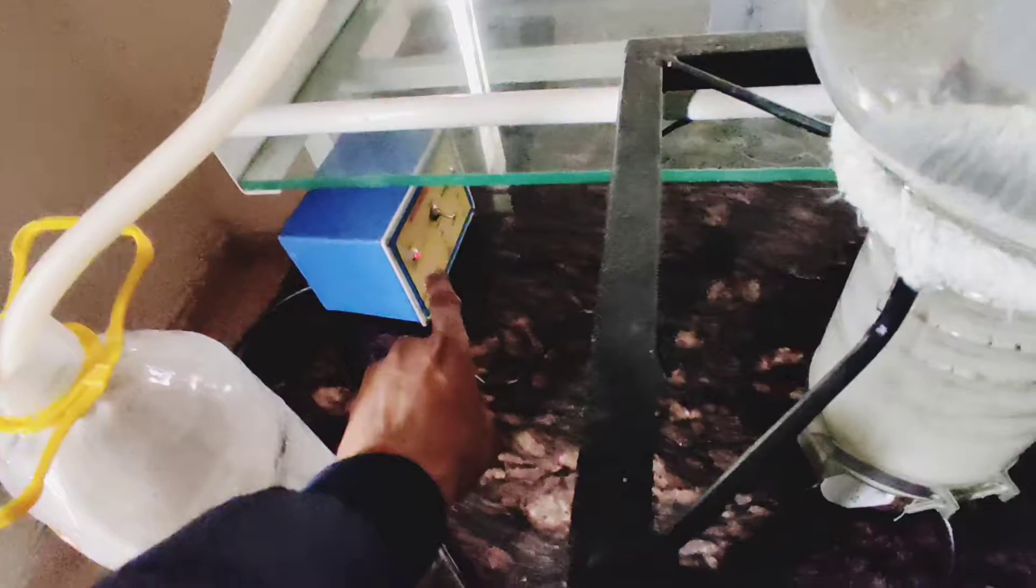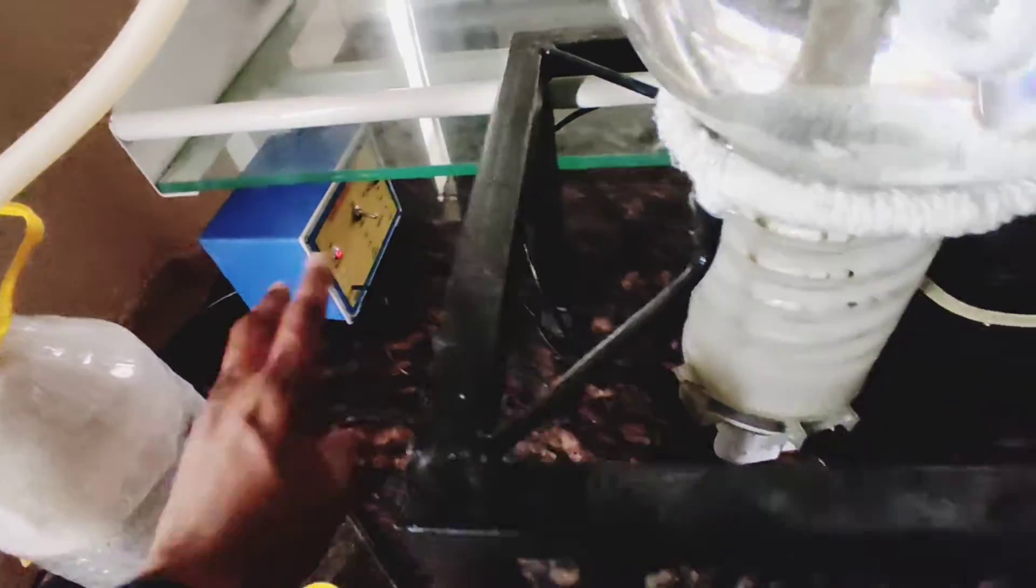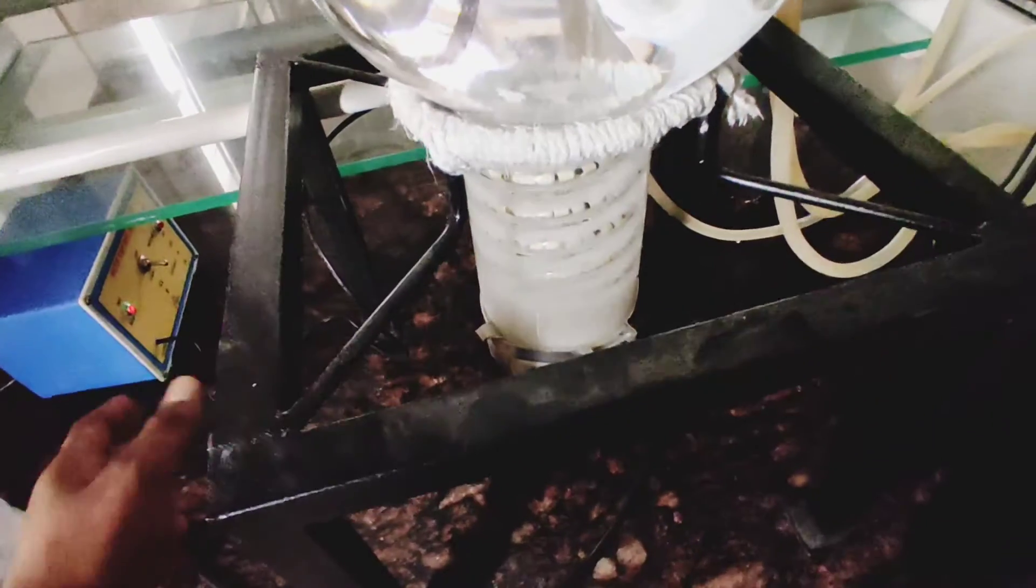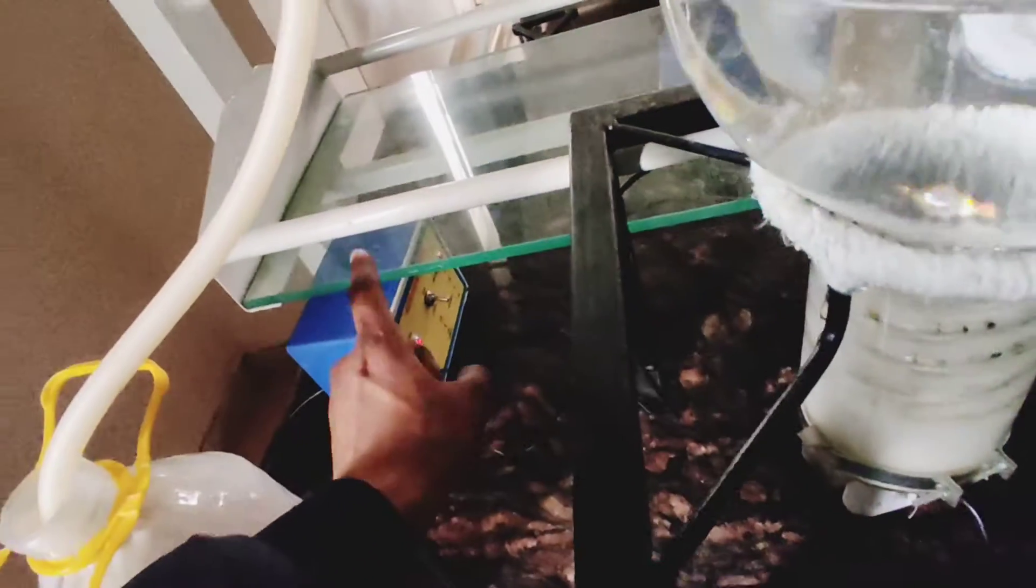When you are seeing this, this is an auto-controller. When you are using the heater, how much the heat is being heated and how much the temperature is being heated, the control is being used.